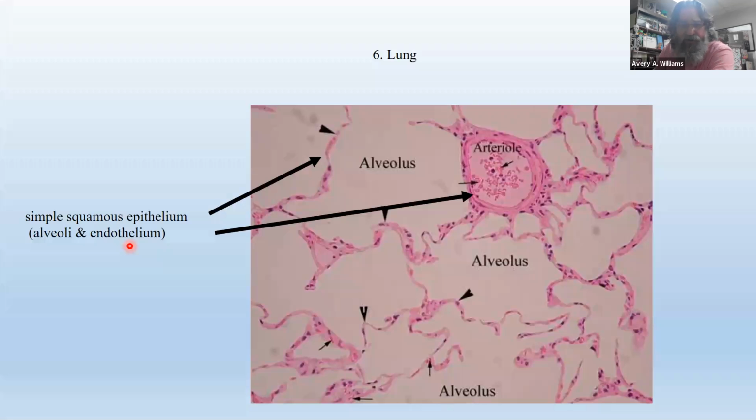And it's always, always, always simple squamous epithelium. So if you're looking at it, and you see these little flat cells lining the inside, flat little cells right here, simple squamous. These are alveoli everywhere. And look how thin. It has to be thin like that to allow for respiratory gases to go through it, right?